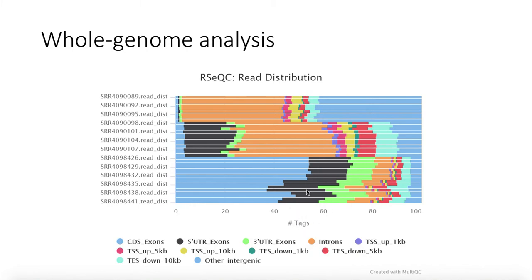But then you get a little bit less of the 5' UTR. You get a whole lot less of introns. That makes sense. Apparently our annotations are not perfect, or some of the RNA may not be pre-spliced, etc. But really, like I said, nascent fills this gap, right? Gives us a complete picture of what's going on in the middle. ChIP will tell us what's binding. RNA-seq will tell us what happens after transcription. Nascent tells us the in-between. Okay?